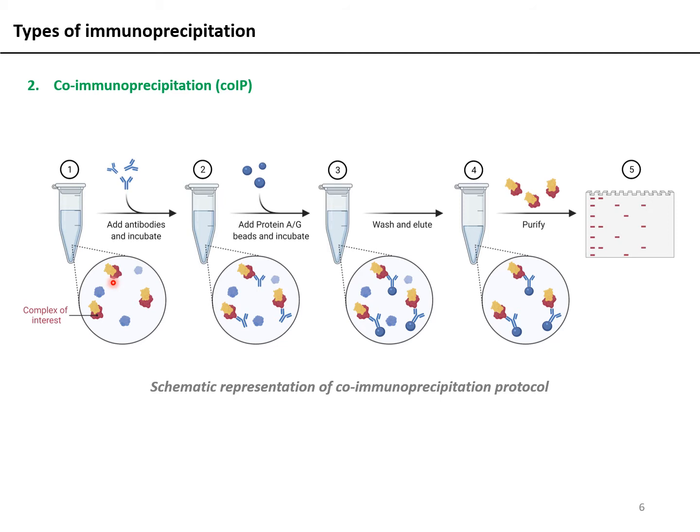Say, for instance, the aim of my experiment is to identify which residues are critical for this protein A, protein B interaction. So how do I do that? One easy way could be a co-IP experiment. How so? One by one, say, for instance, I suspect that there are 10 residues which can be involved in this interaction or which can be important for this interaction.